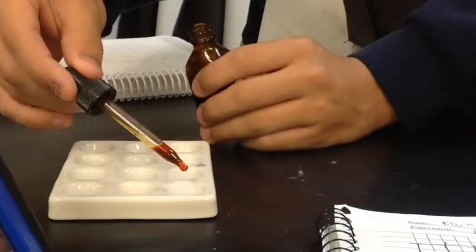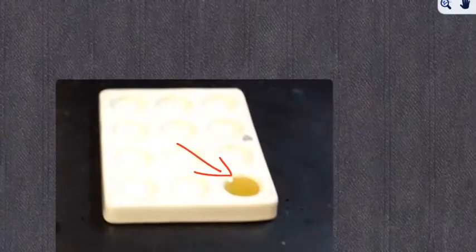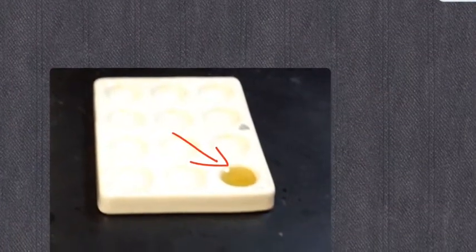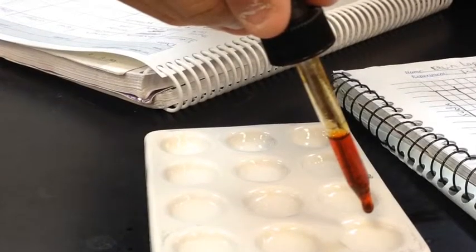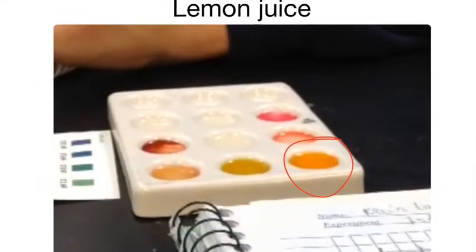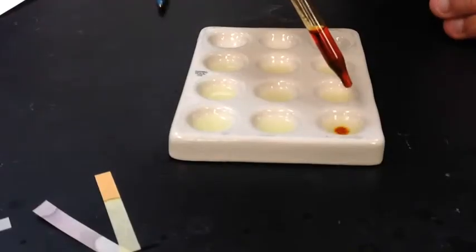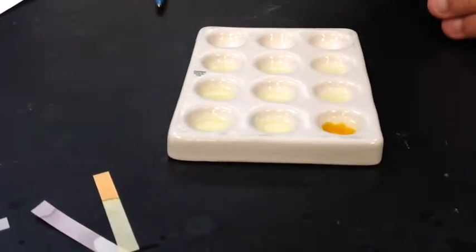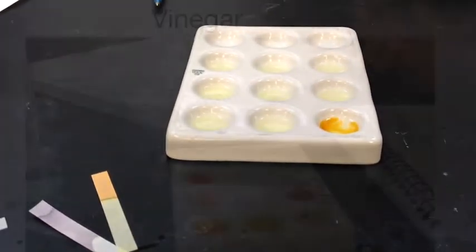As you can see, in this example, we put 1 drop of thymol blue into 10 drops of ammonia. And when we did that, it gave ammonia a yellowish color. Therefore, it's a base. When we put the thymol blue into lemon juice, it gave us a reddish color, so we determined it was an acid. Although the color isn't very red, it is closer to red than yellow. Therefore, it's an acid. Now, you see us putting thymol blue into soap. Soap is a base, and it gave it a color of yellow, proving it is a base.